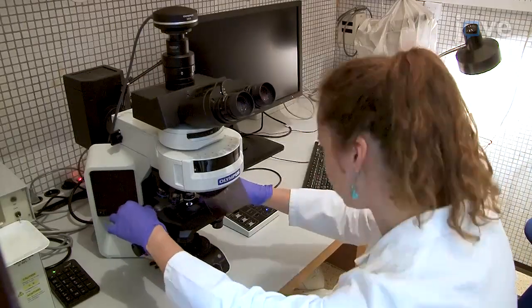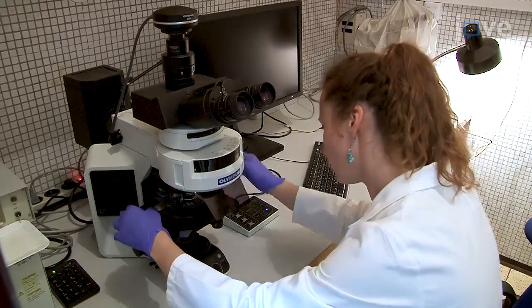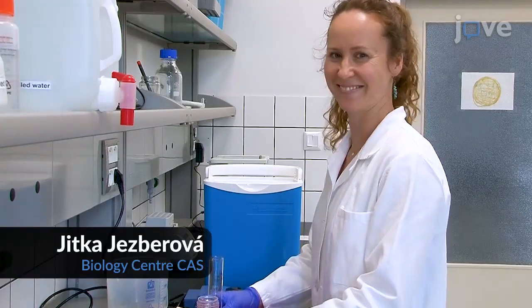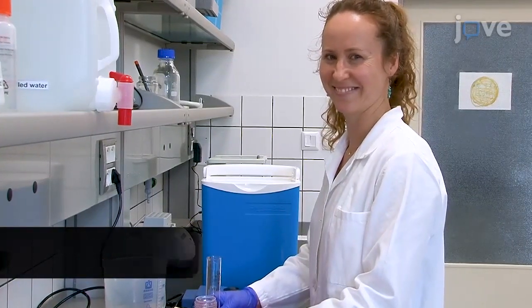We highly recommend that researchers become familiar with their study system before they conduct any grazing experiments. This involves light and epifluorescence microscopy, inspection of the samples, and the knowledge of main taxa present and their seasonal dynamics. Demonstrating the procedure will be Jitka Jezberová, a researcher from our laboratory.